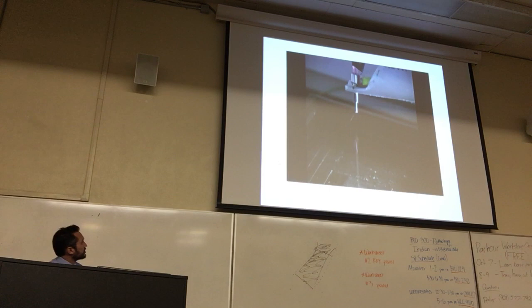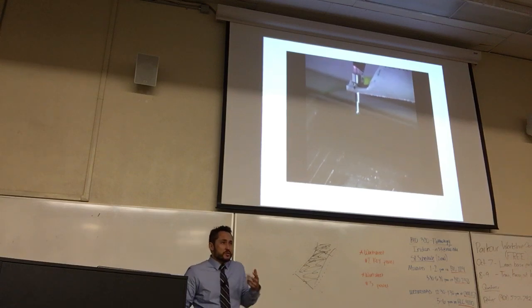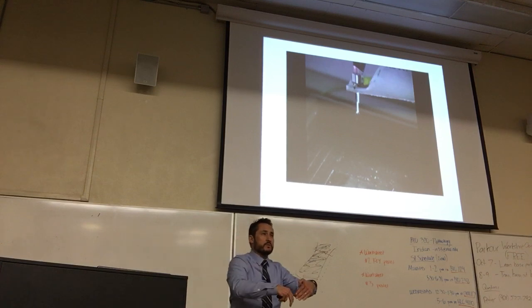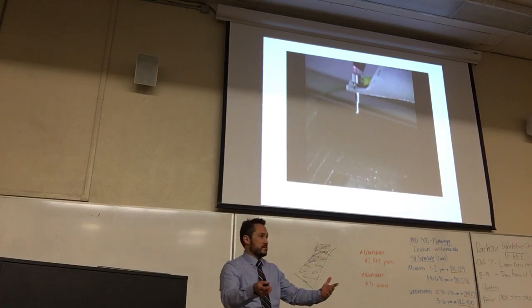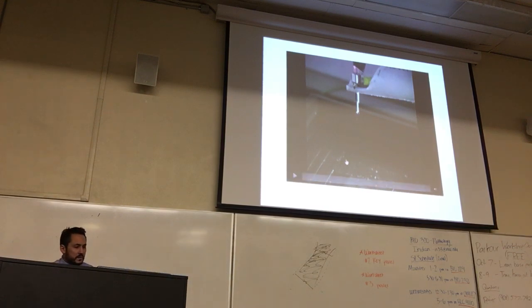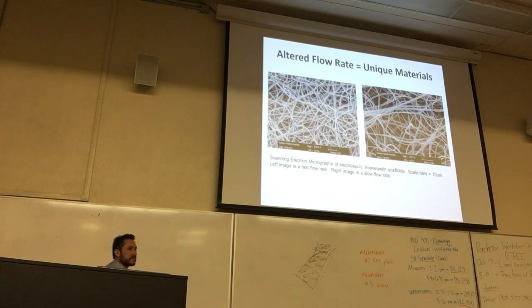And this is the fibers being electrospun onto a resulting target. What we're trying to do is first create the extracellular matrix, and then populate it with cells, skin cells, okay? Or in this case, stem cells that are going to become skin. Okay? So the electrospinning results in architectures that look like this.